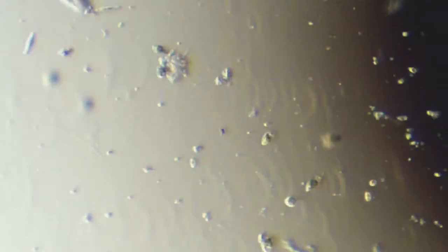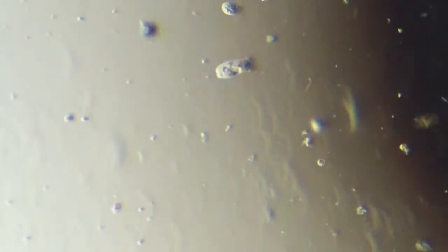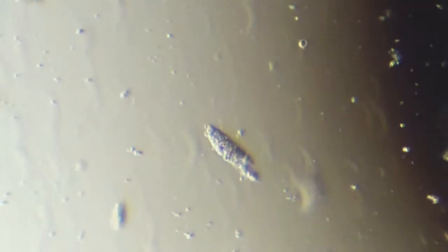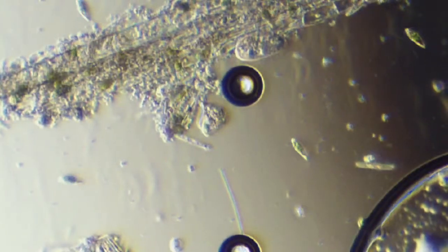It also adds more material to the slide, so there's more material for them to swim up and down in, making it harder to focus, but at least they're slowed down and not so crazy like this guy is, so you can study them. Also, with my DSLR, I can shoot slow motion footage and play it back, which is fun. So you can study things that way as well.